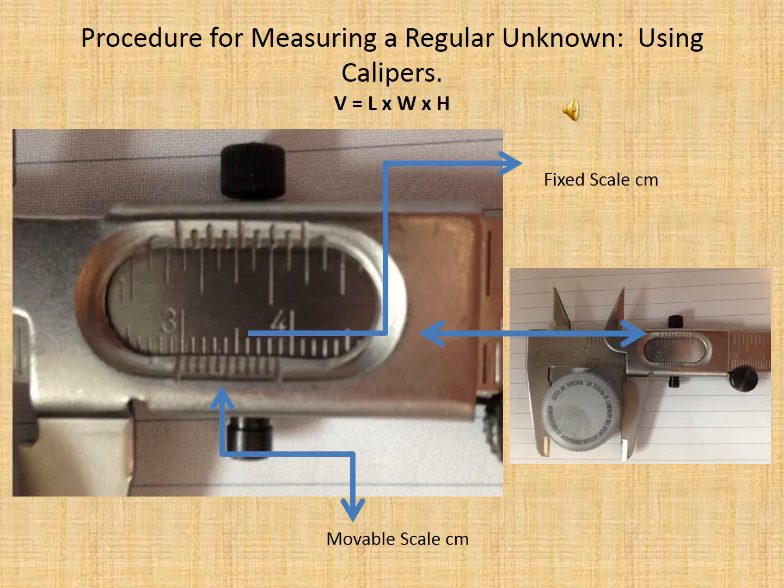I've shown you in the pictures a caliper that I'm using to measure the diameter of a bottle cap. The first thing you need to realize about the caliper is that you put the thing you're wanting to measure inside that movable jaw there and you fasten it tight. After you do that, you're going to take your measurements.